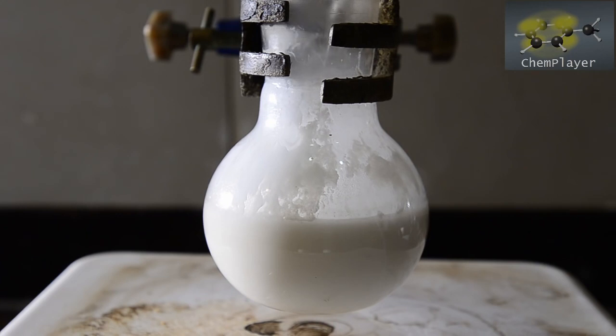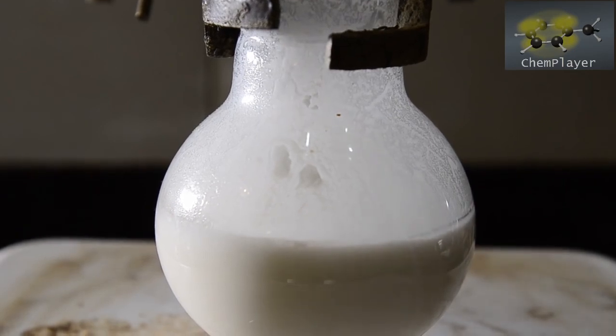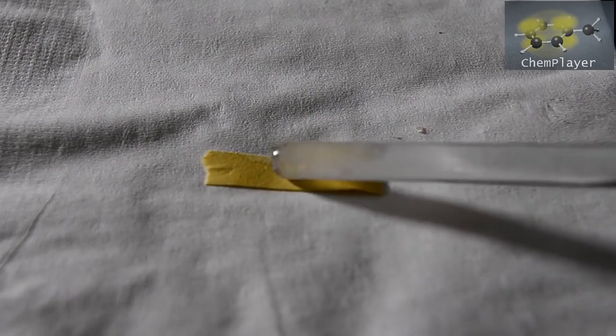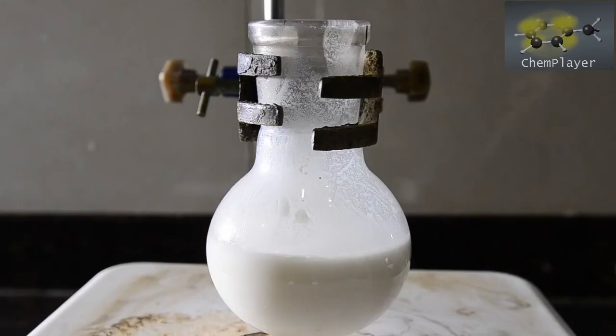On addition, the white precipitate starts to become lighter in volume. The mixture at this stage is still strongly alkaline, as you can see from the indicator paper. So we keep adding the hydrochloric acid slowly.